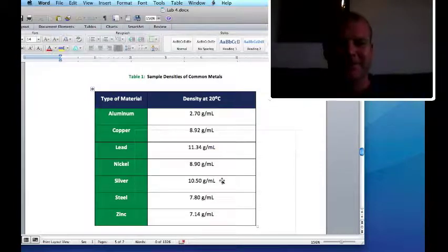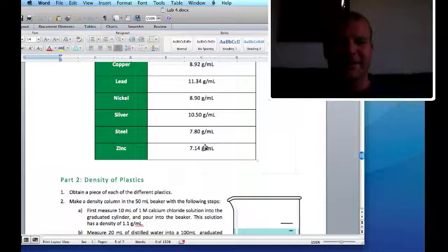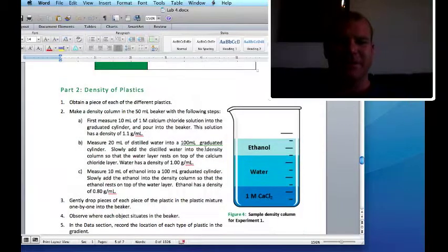But anyways, so it's probably going to be steel or zinc, and of these two, most likely zinc. So try it out, see what you do.